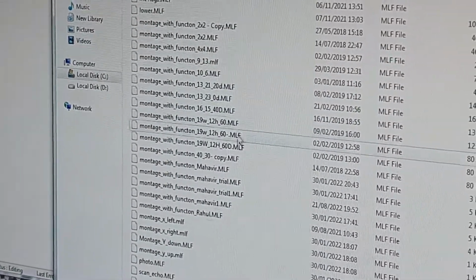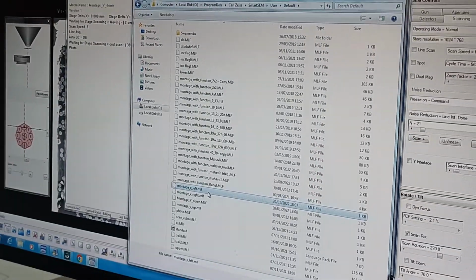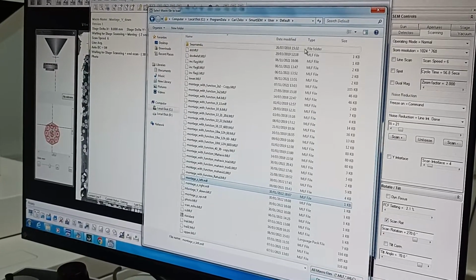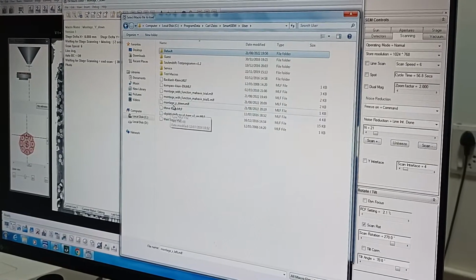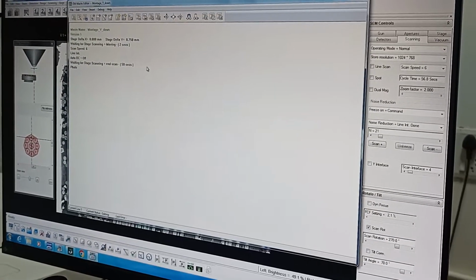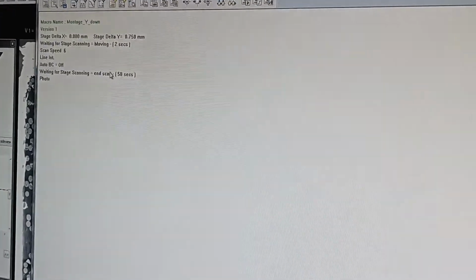At this time, I'm going to open the next one, the left one. I'm opening this. This you can check. This one, if I go one level down, and this one we have just now changed. If I call this, you will see that these numbers are there, whatever we entered. So it's a plus point.